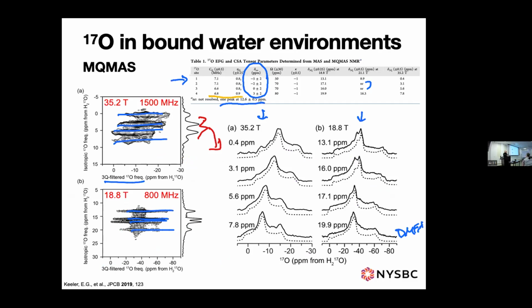In fact, I do know that I have deuterium spectra at room temperature and at low temperature, and it hops. So I could show you them. I like deuterium spectra. Why would you hide your deuterium spectrum from us? I'll have deuterium DNP spectra of the gadolinium doped sample.